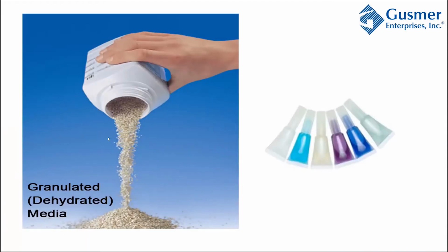So I wanted to talk a little bit about the two options for media. So you have the granulated dehydrated media. And this is going to be much less expensive, although you're going to have a trained microbiologist or someone who's highly trained in aseptic technique. You're going to have a hot plate, a flask, an autoclave, all those things in your lab to be able to make your own dehydrated media. So another option are these liquid ampules.